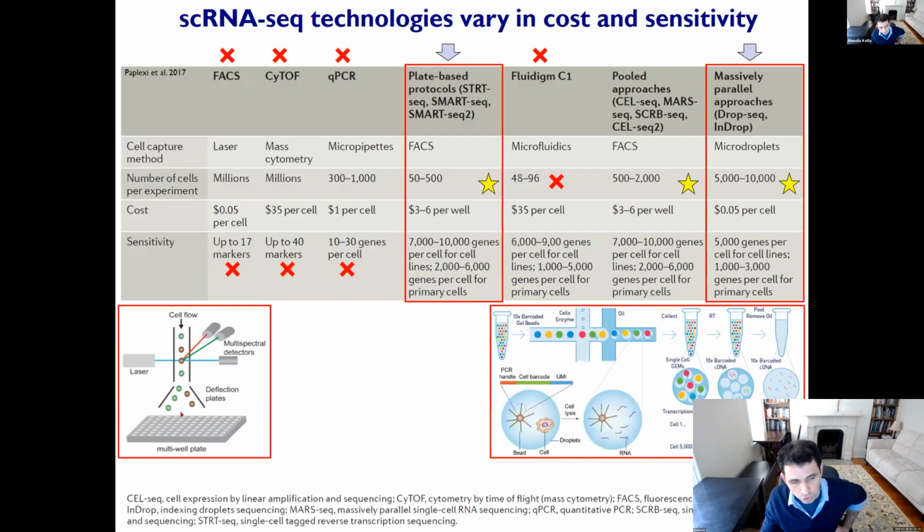So you're now capturing individual cells. Instead of capturing them in wells, you capture them in droplets. And every droplet has its own bead with a ton of barcodes. Who's with me on this part here? How we're replacing the wells with droplets. And those droplets are basically serving as a way to separate individual cells from each other so that we can label all of the RNAs of the same well in the same cell type, or sorry, in the same cell identity. So we're at 80%, 20%, 400.